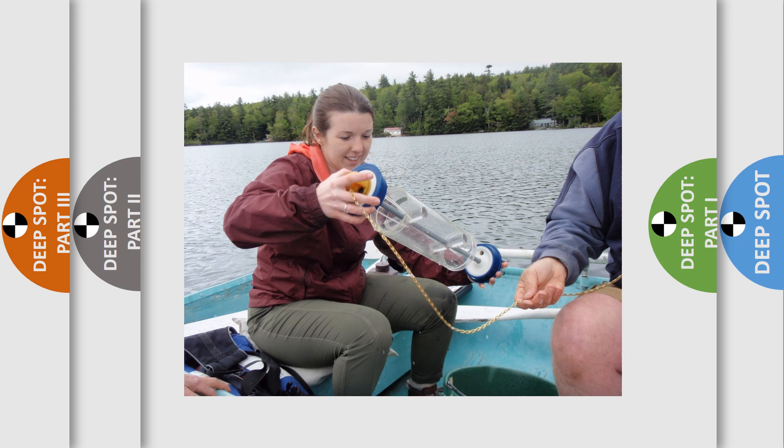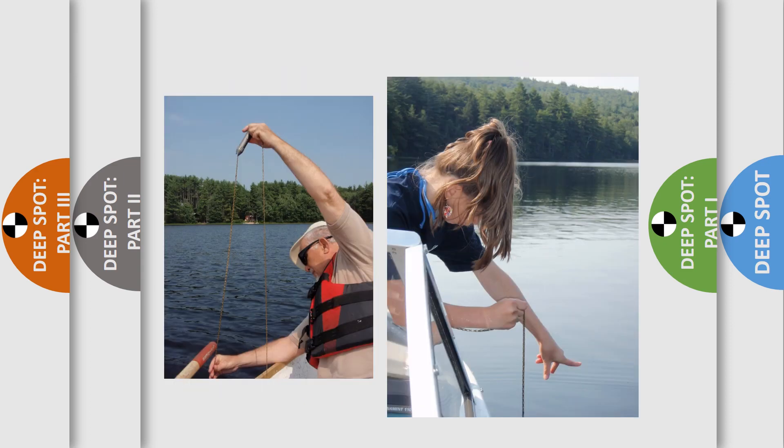Once the bottle is set up, pull apart both ends to lock the bottle in the open position. When you pull the ends apart, the bottle should click into a locked open position. Lower the bottle into the water column to the desired depth. The chain or rope has a mark every half a meter. Place the mark of the desired depth on the water's surface. Take the messenger, the weight used to close the bottle, and attach it to the chain. Do this over the boat so you don't lose the messenger in the water if you drop it.